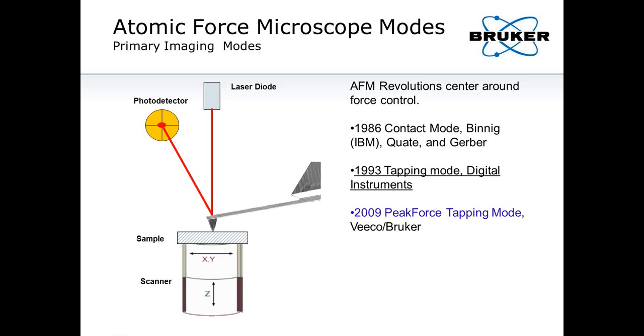You get the topography of the surface. And this is how simple the concept is. Of course, there are some tricks, because for atomic force microscopy or scanning tunneling microscopy, you get very, very high resolution. That's the only difference. And we are talking about atomic resolution, molecular resolution, nanometer resolution.